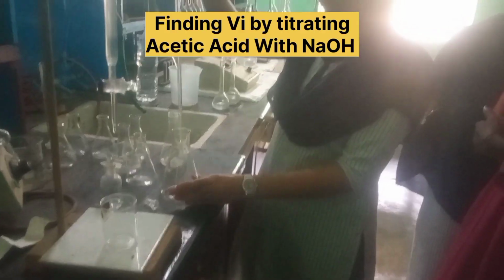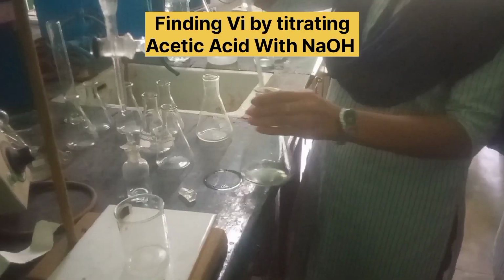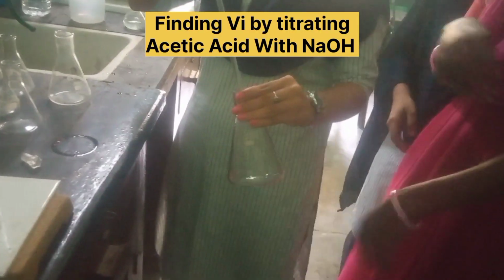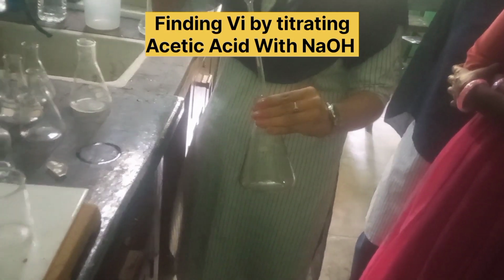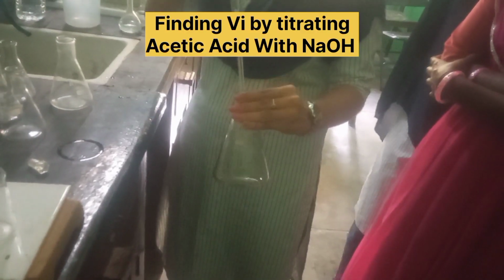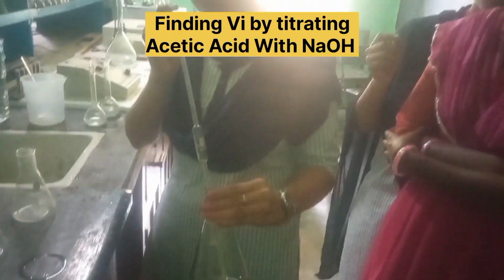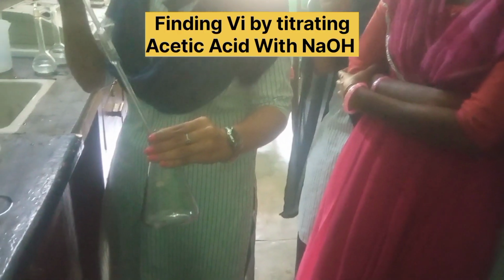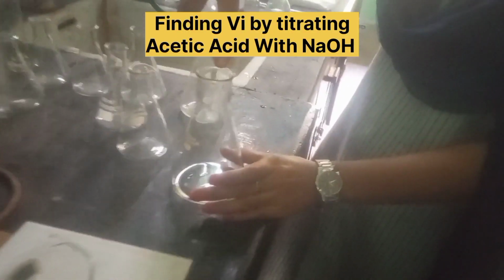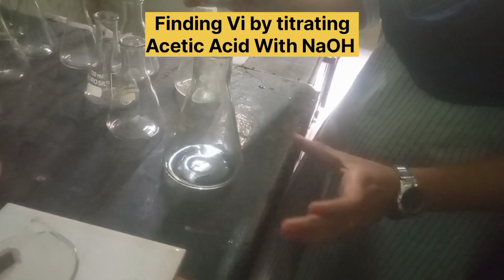Before that, one has to find the initial volume of NaOH for neutralizing the acetic acid. This is said to be standardization. And the volume of NaOH is considered as Vi, I means initial. So after getting the value of Vi, that means the volume of NaOH required to titrate acetic acid taken in conical flask added with phenolphthalein indicator. Here in all titrations, the endpoint is pale pink.